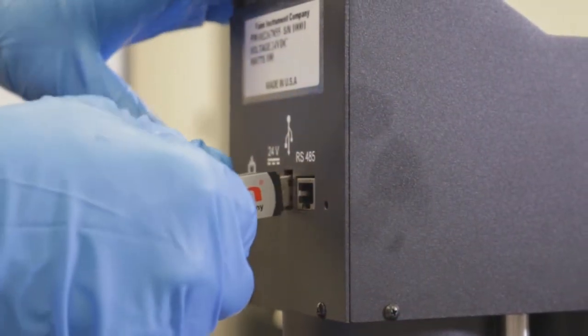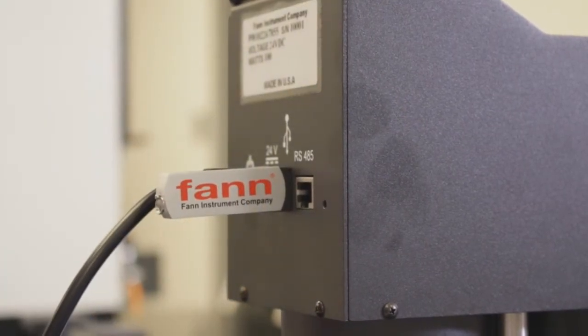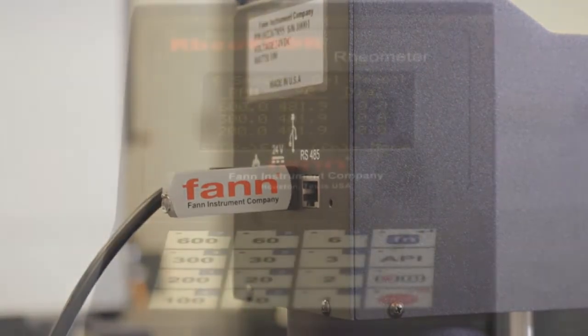Plug in a USB thumb drive and your test results are recorded in a standardized file format that you can use in Excel or other spreadsheet programs.